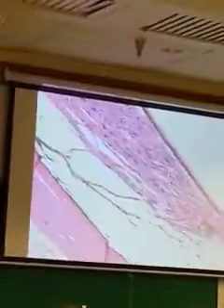And then down here, we're at the posterior portion of the eye. But let's do this instead. Let's go back to the ciliary body and just follow all of this around. And here again, we're at the back of the eye. And that's as far as we can zoom out.